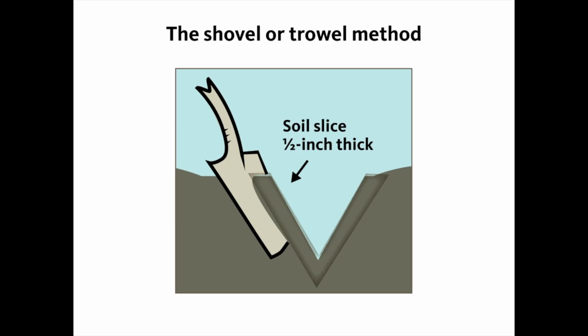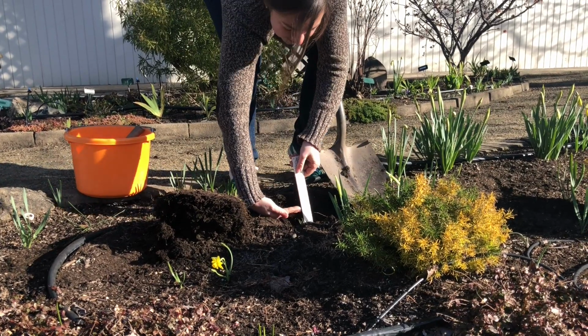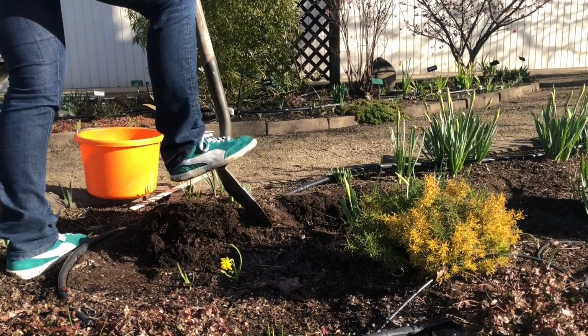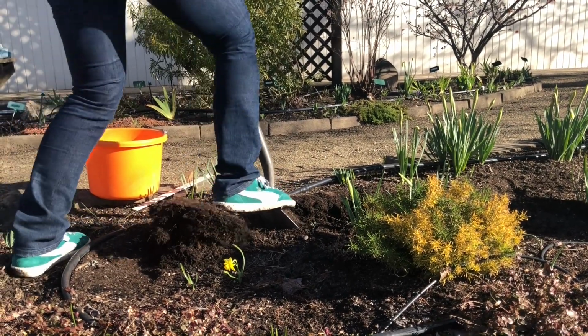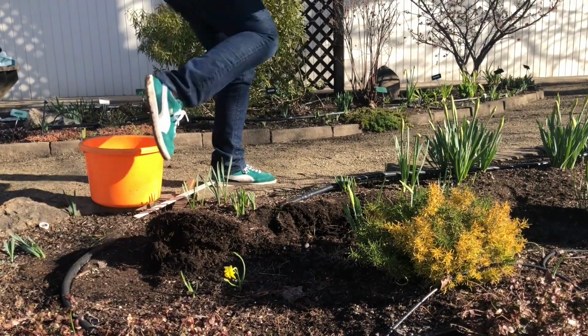With the shovel or trowel method, you will be cutting a wedge out of your soil and then taking a 1/2 inch to 1 inch thick slab from that wedge. You'll see here why this is difficult to do. As we slice into the wedge, we encounter a root mass underneath, and we come up with an inconsistent width in our sample.